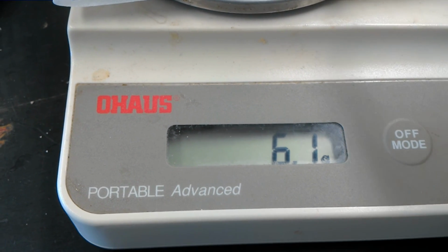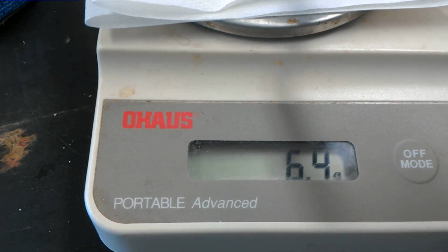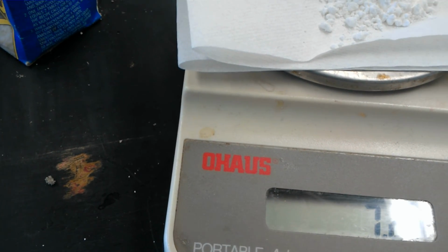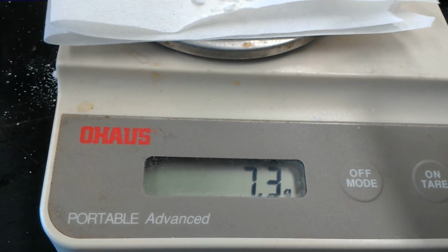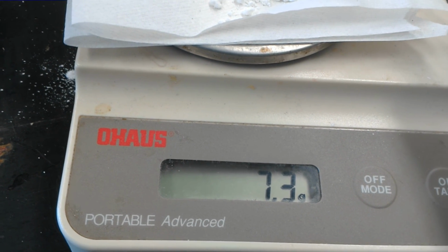Which, I mean, truthfully, it comes out to approximately a teaspoon. So about a spoonful. Again, we don't have to be super specific with this because we're not looking for a specific chemical reaction here. We are looking for the chemical reaction, but just if it's there, it'll show us what we need to see.